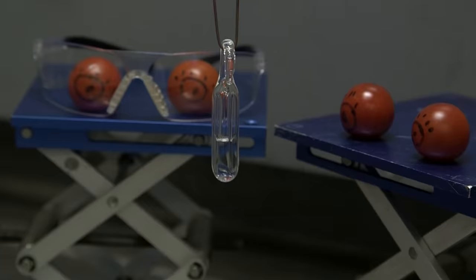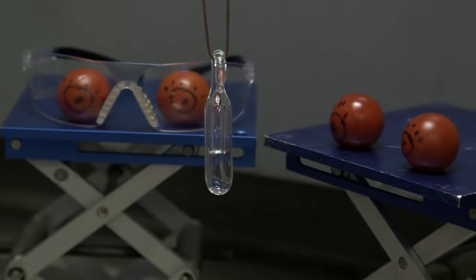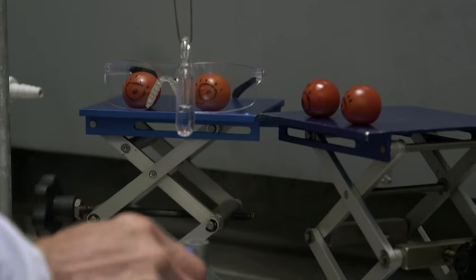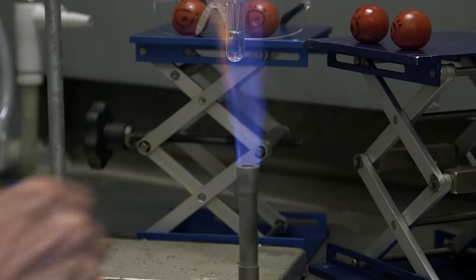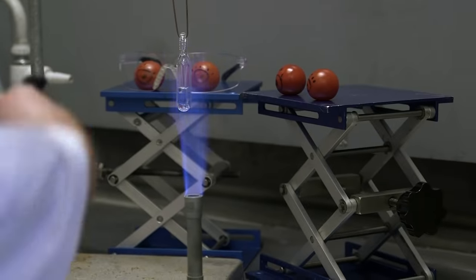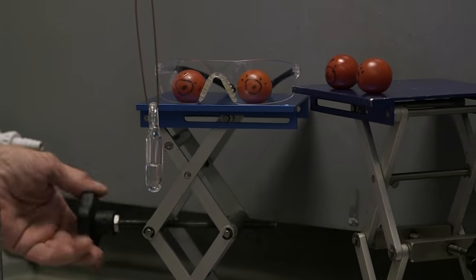Two of the tomatoes are wearing safety glasses, two of them are not. We use tomatoes because they're a bit like eyeballs, and we thought it would be much too gruesome to get real eyeballs from the butcher.